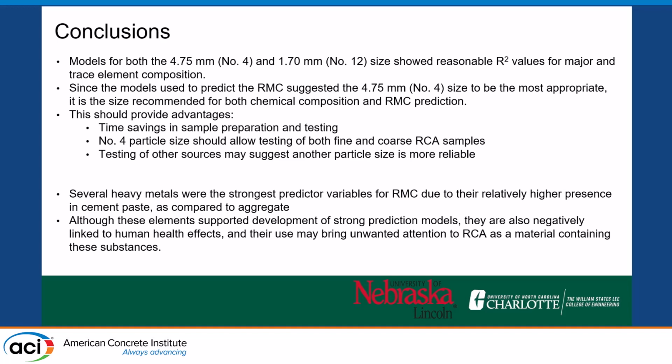One of the downsides, we did see that the heavy metals were the strongest predictors of residual mortar content, and although they're there in very small concentrations, there's a lot that goes on that nobody's really drinking the water coming off of RCA. It may draw negative attention to this material that we really want to use in a recycling application, which was a little bit disappointing, but could be overcome.